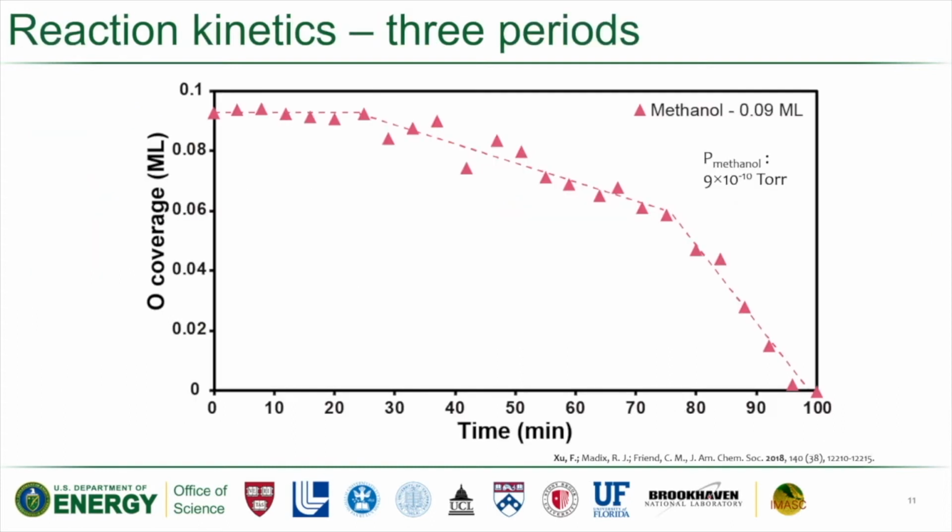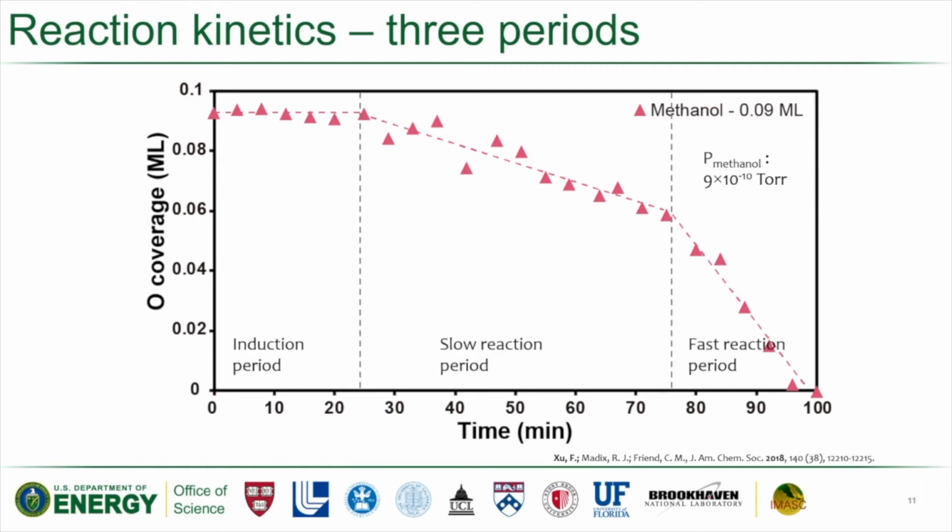With this in situ or real-time measurement, one advantage we can gain is to establish the dynamics during the reaction. So this is from each STM image. I measure how many oxygens are left over on the surface. With this plot, you can see how the oxygen is consumed during the reaction. As we saw while watching the movie, there is an induction period where there is no obvious decrease of the oxygen coverage. And then we move to the slow reaction period and then the fast reaction period. So it's just some kinetics during the reaction.